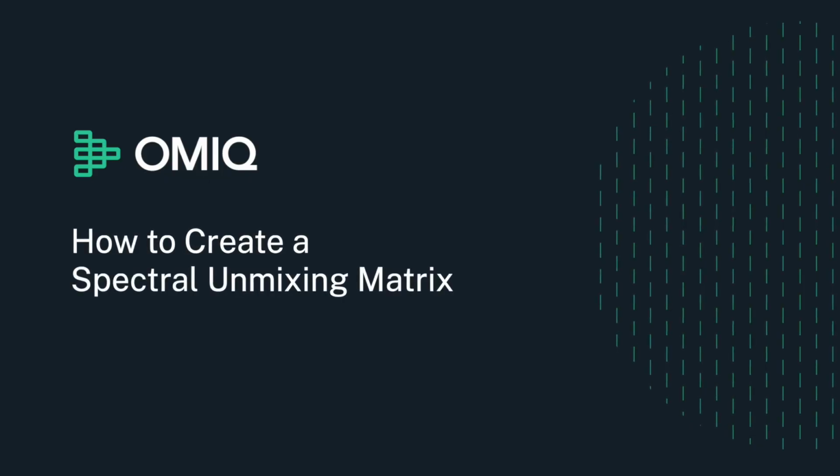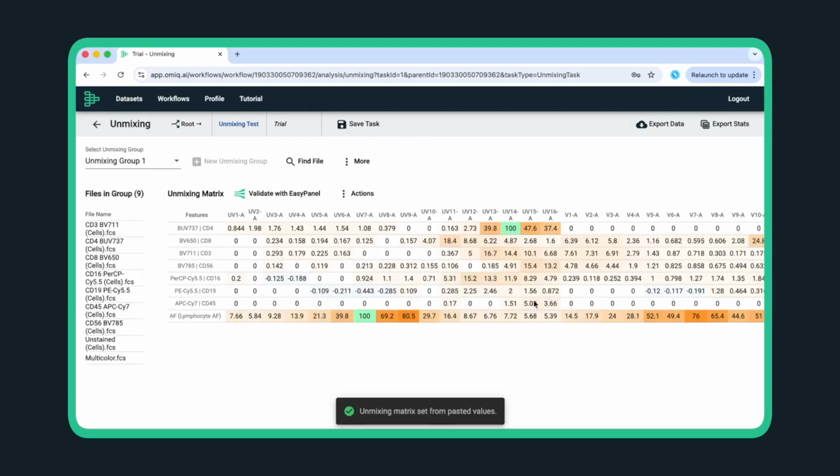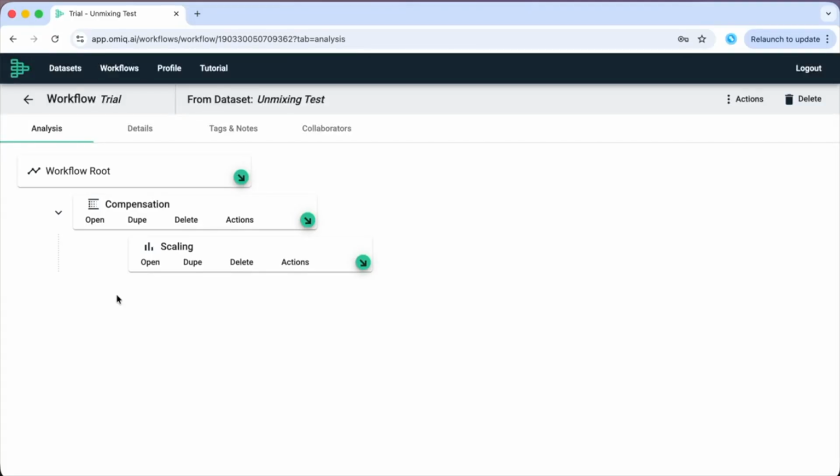Welcome to this video tutorial on creating a spectral unmixing matrix in OMIQ. The Make Unmixing Matrix task allows you to build a matrix from single stained controls and apply it to your files for downstream spectral analysis. Start by opening your dataset and creating a new workflow.